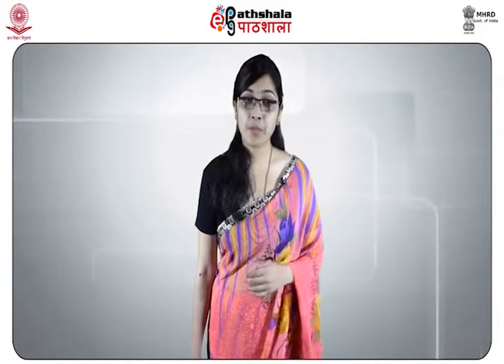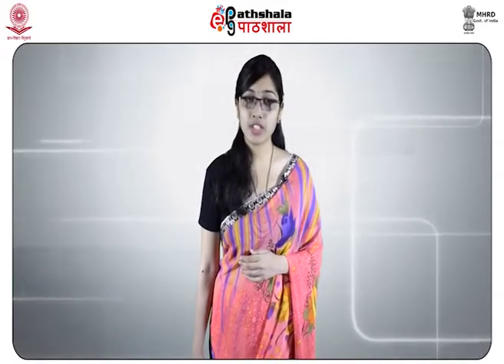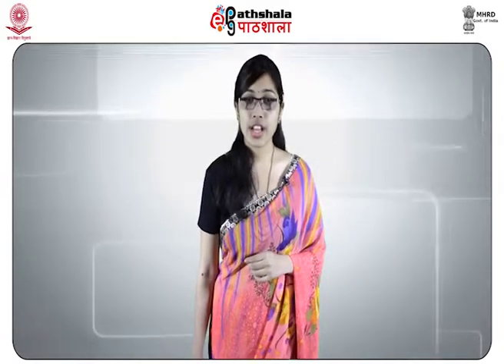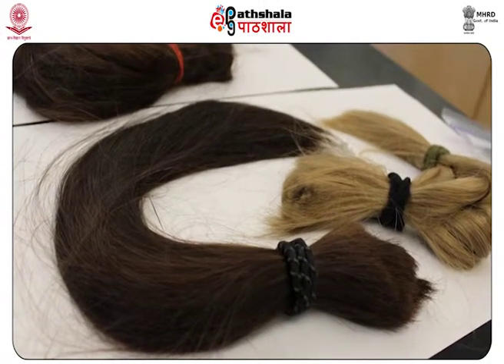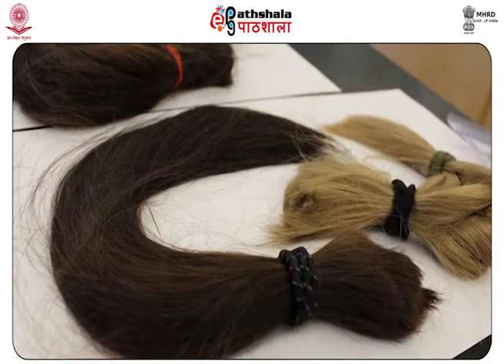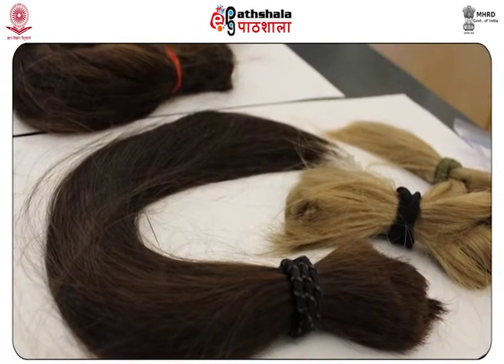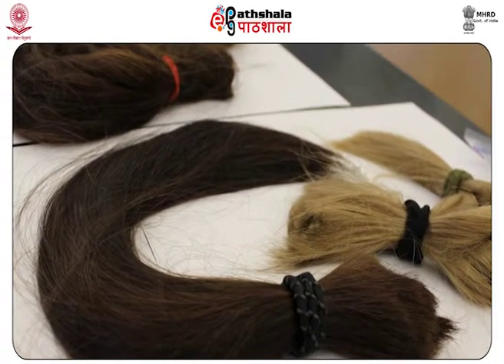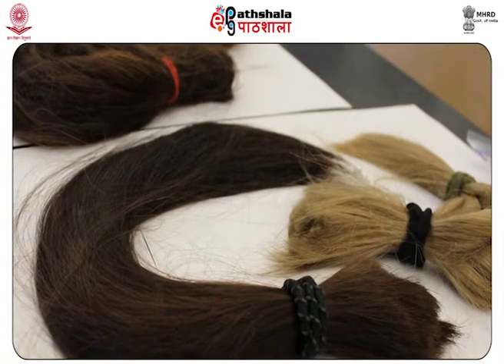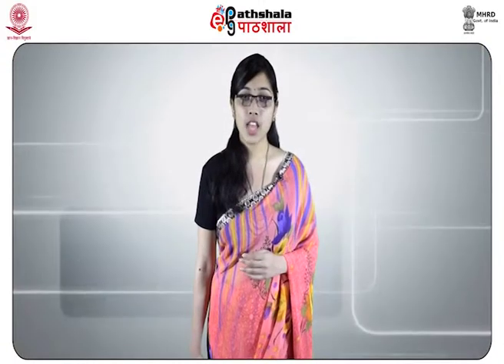Next is the pigment distribution in hairs. It is helpful in the study of species of origin and in the identification of hairs of an individual. It is often an important characteristic and permits elimination of certain suspected sources of hair. Next come the roots and the ends.